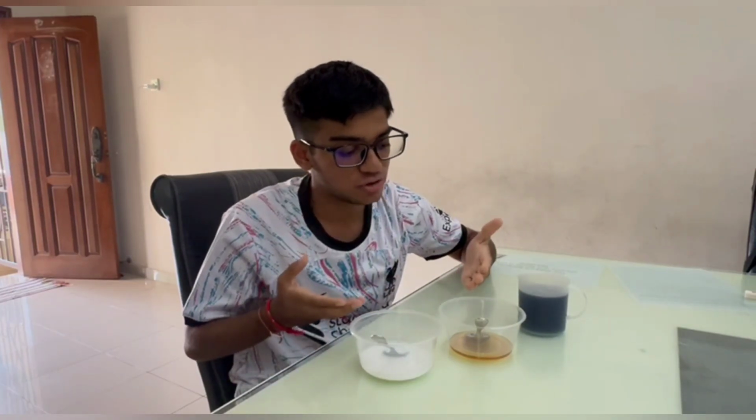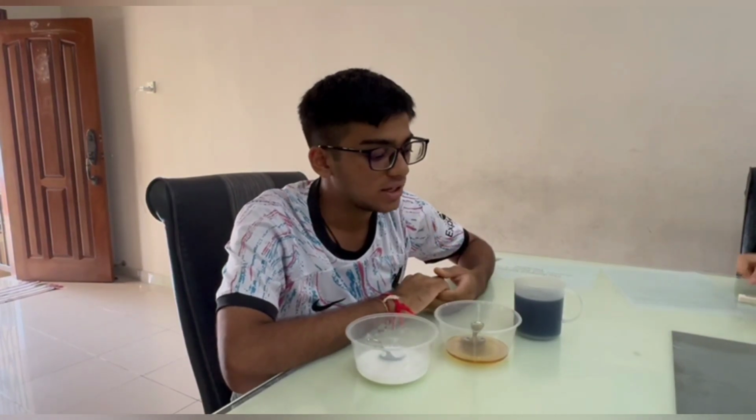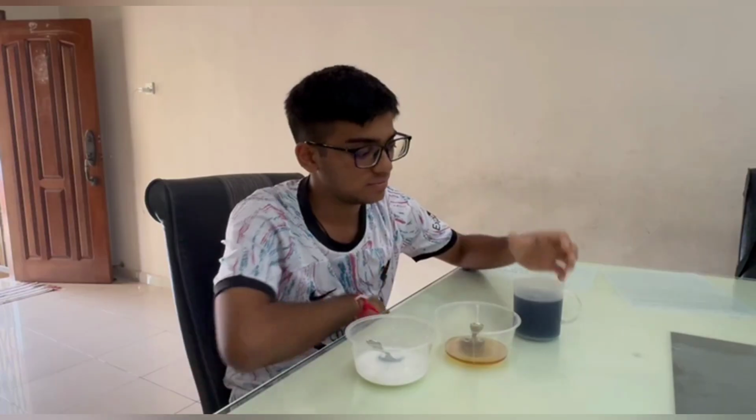Now, after I have prepared the red cabbage solution, I will carry out an experiment to determine if red cabbage can be used as an acid-base indicator. Here, I have 2 solutions with me, which are honey and toothpaste. Just a gentle reminder, since toothpaste is in a solid form, we will have to add some water to dilute it. Now, I will carry it out one by one.